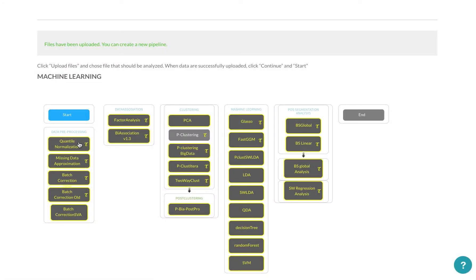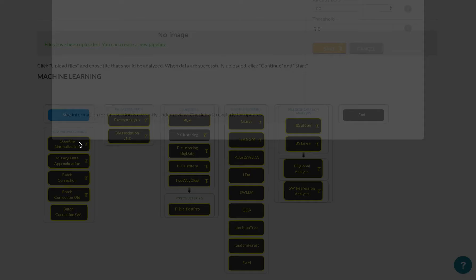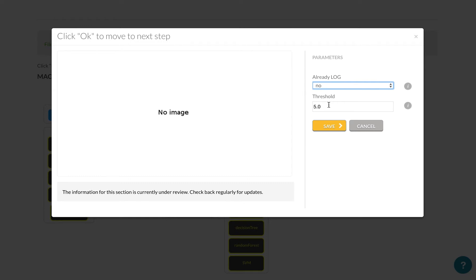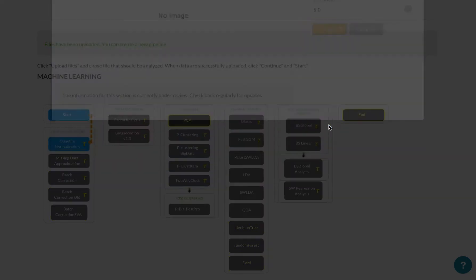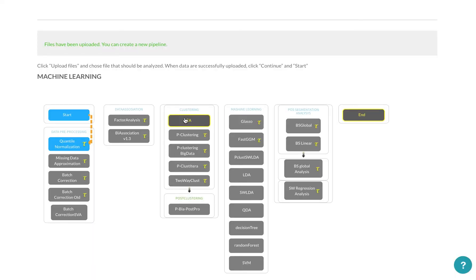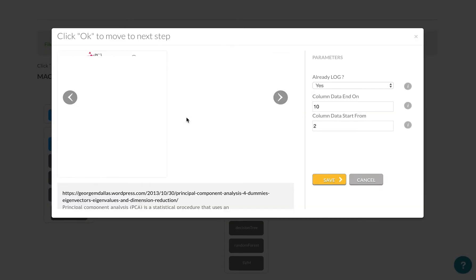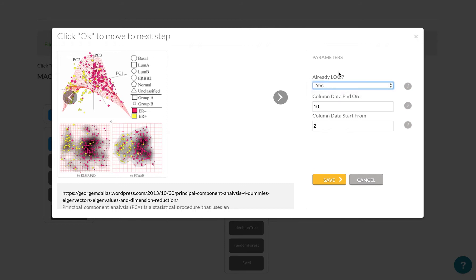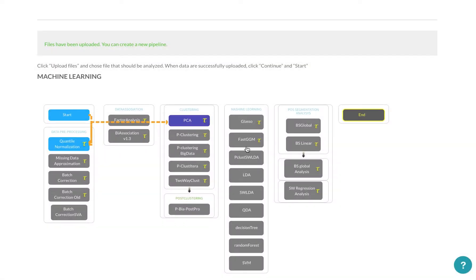What I'm going to do is build a pipeline with quantile normalization. I can select here if it's already logarithm values and what the threshold is for quantile normalization. Then I can do a PCA. Here I have to again select if it's log or not, and then select the table position, the column position where it ends and where it starts. Typically you would have the ID in the first column. Now you can save and end.